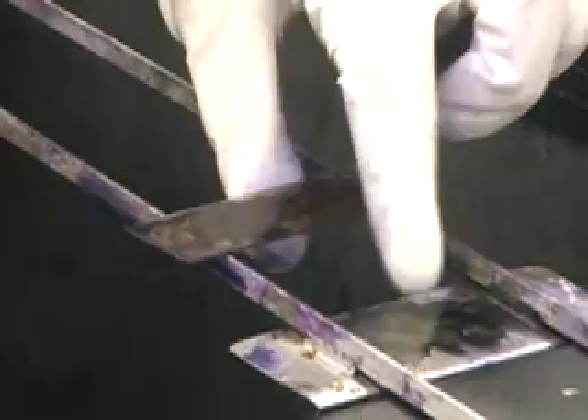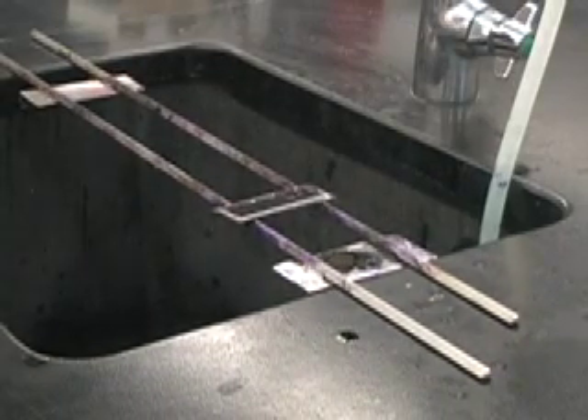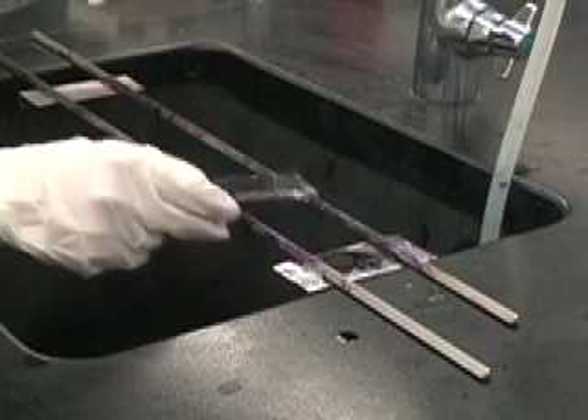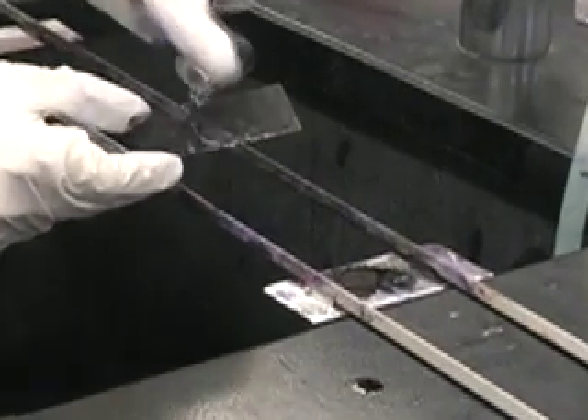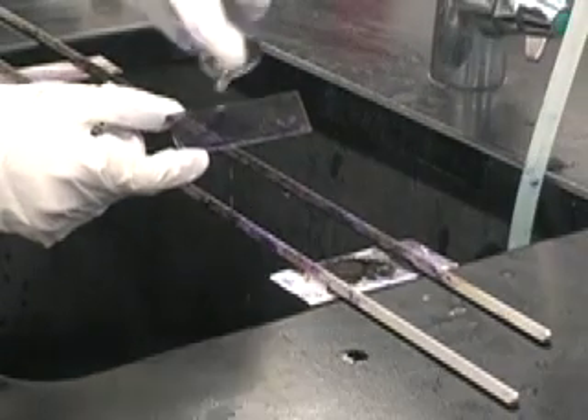Now that the Gram's Iodine has been on for 30 seconds, you'll rinse your slide off with water. The next step will be to add 95% ethanol. You'll add enough ethanol until the color you see running off the slide is a pale lavender color.